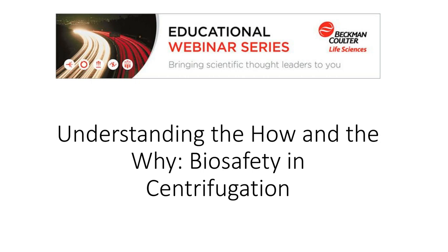All right, thank you. Next question. Can you use 70% alcohol to clean the centrifuge chamber? So the thing about alcohol is it is a disinfectant. So if your goal is to disinfect, you could use that. It's also a different solvent than water. My recommendation, and Bob will correct me if I'm wrong about this, is you start with water.